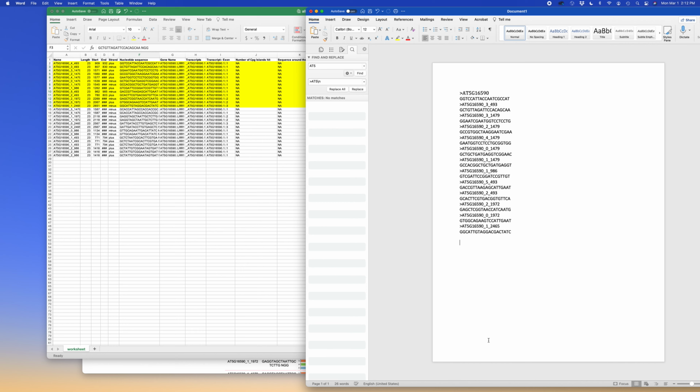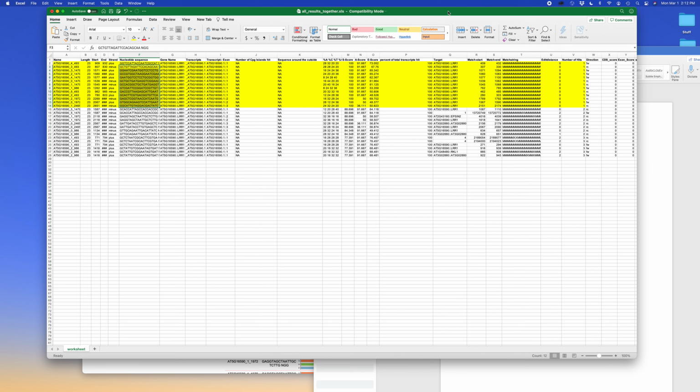Okay, so there's my little file, and I should probably save that or copy and paste this into my notebook in case we need to repeat it, but we have what we need. Okay, let's put this away for now.